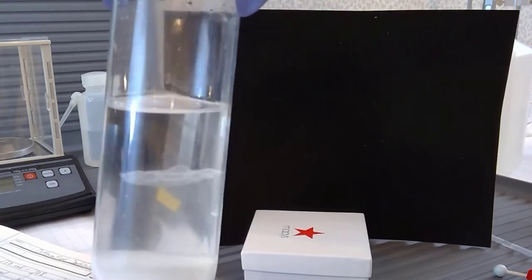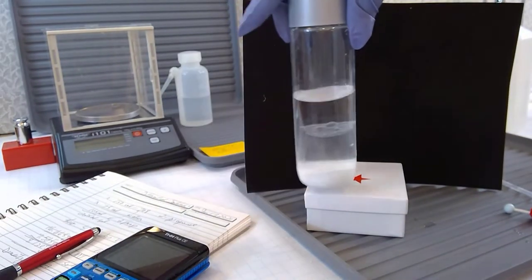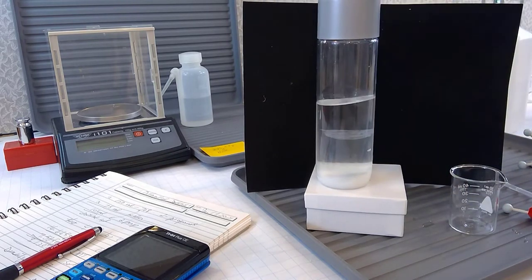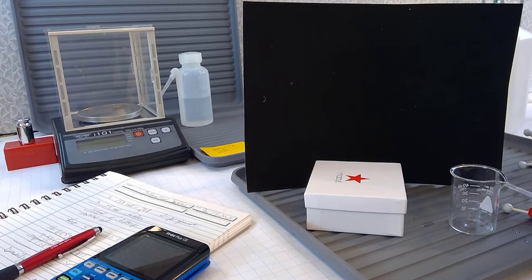The salt water solution at the bottom, the denser one, and then the propanol that has been squeezed out, and now the propanol is sticking to itself. It doesn't have anything else to stick to, and the water there. Now let's see how effective this is by, again, finding some density. I'm going to decant some of that squeezed out, purified propanol into my beaker and do a density check.